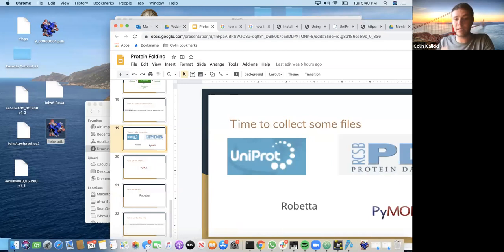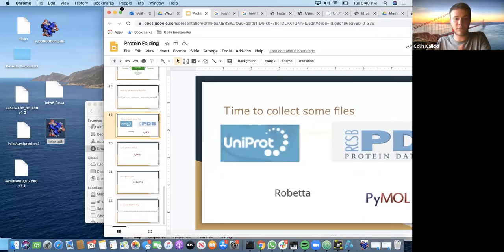The PDB file gives you kind of a template. It is this folded protein as it comes, as we know it, right? Maybe we tested this in the lab with X-ray crystallography. We know what this protein looks like with 99% certainty. We're on top of it. That's what the PDB file should be if you're getting it from PDB or UniProt, maybe.